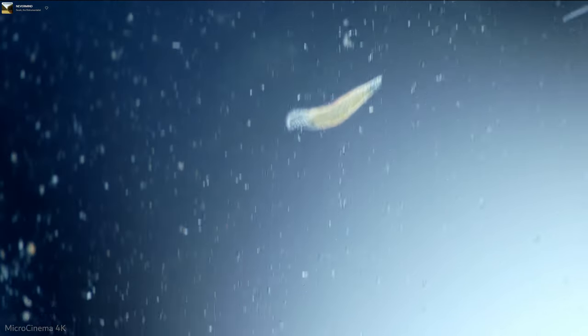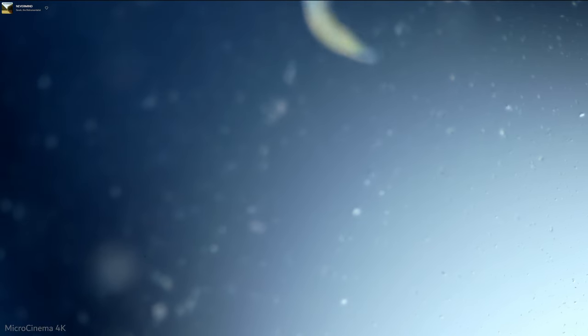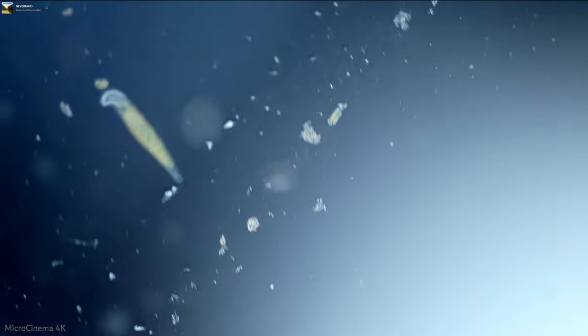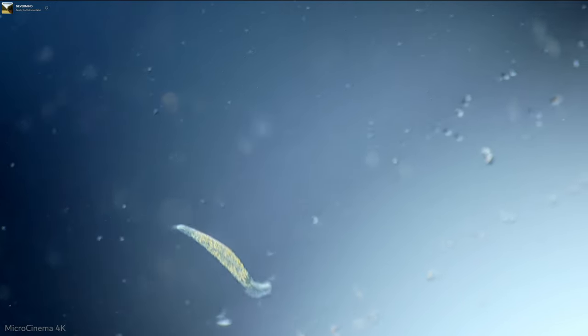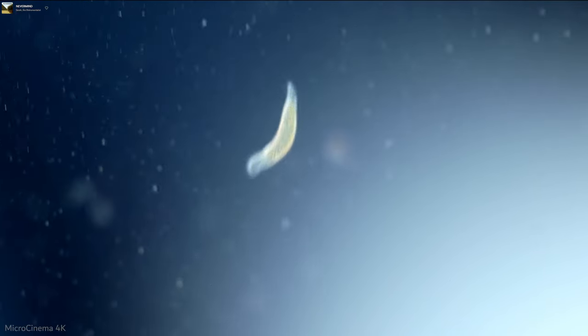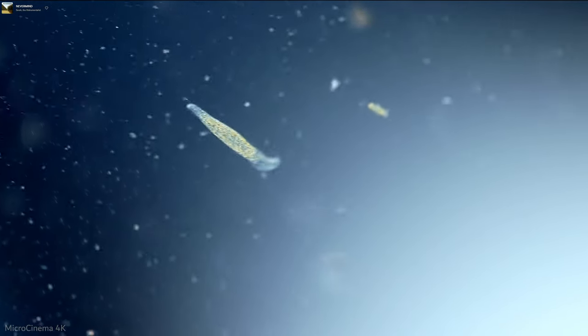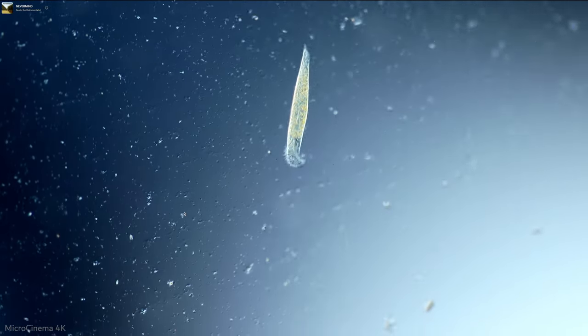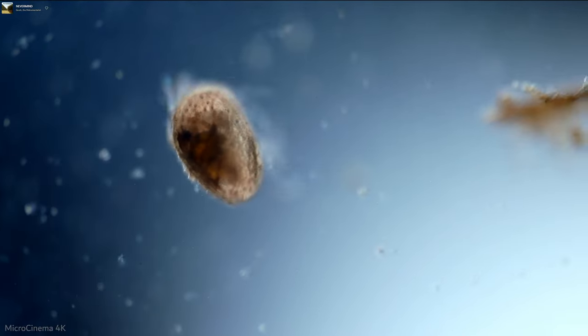So let's see, I got a few questions in here. Let's see. Yeah, tiny RFID tags. So yeah, I'm basically gonna stick RFID tags to my objectives, and I'll have a little antenna that will measure and detect the highest strength RFID tag, which will hopefully be the objective that's currently in position. And then that will talk to OBS and tell OBS to change a scale bar and maybe even change the lookup tables that I'm using. So anytime I change objectives, everything else is just gonna like change for the better. So we'll have a scale bar, but we'll also maybe like change the contrast specifically for that one objective.